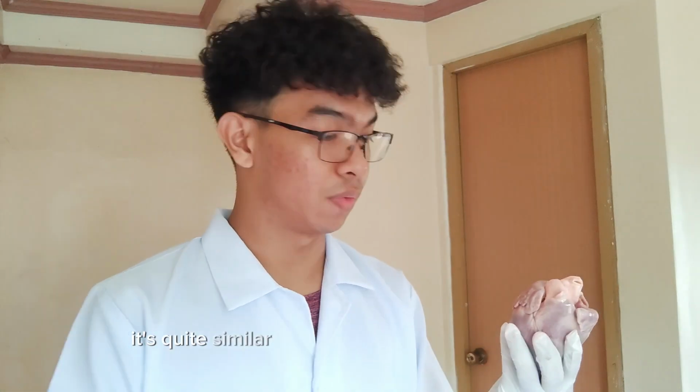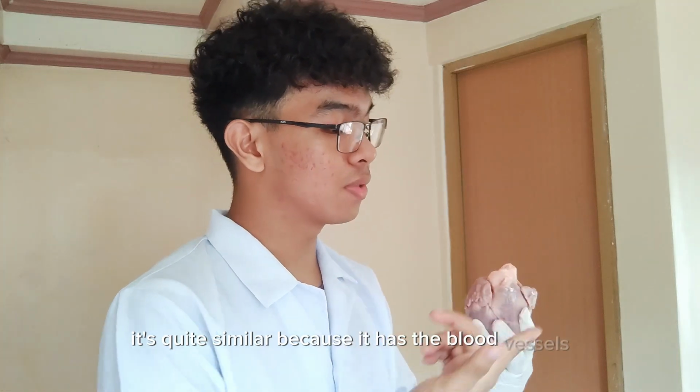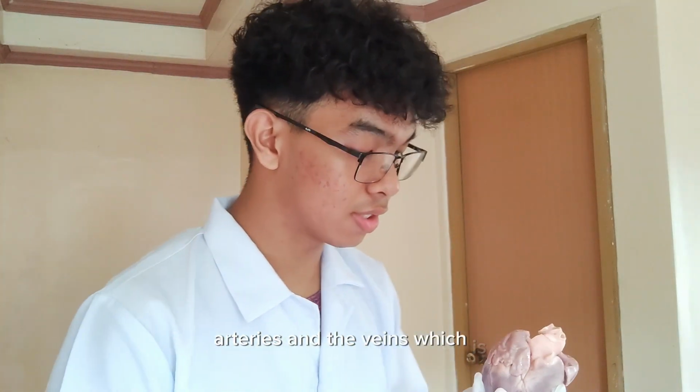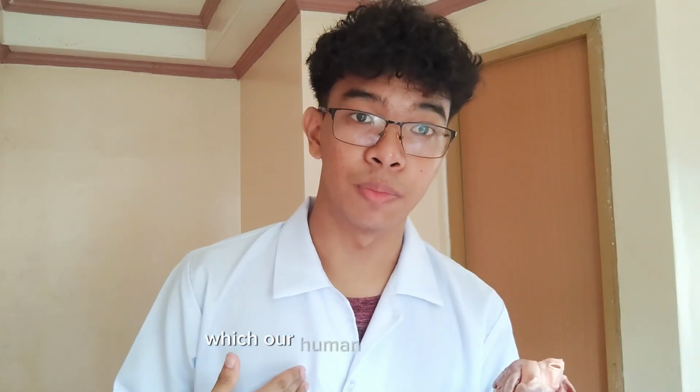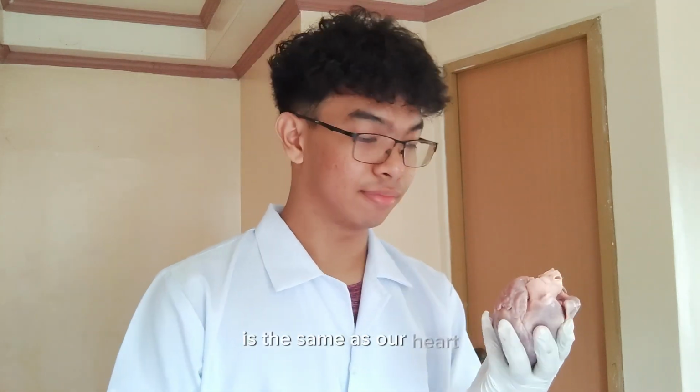It's quite similar because it has the blood vessels, arteries, and veins which our human heart contains. It's also a similar size, like fist size, the same as our heart.